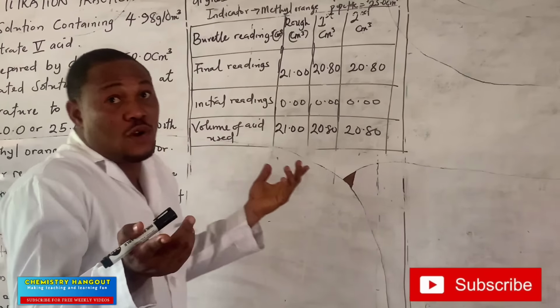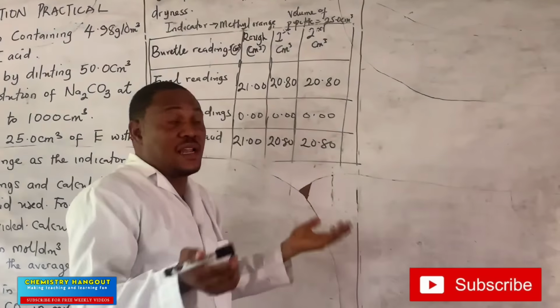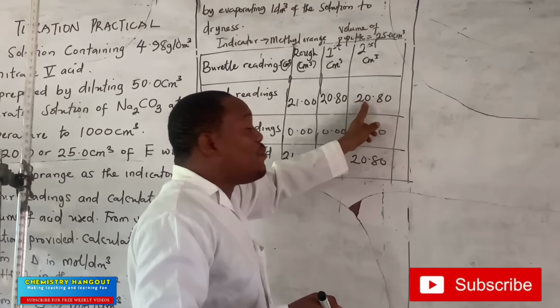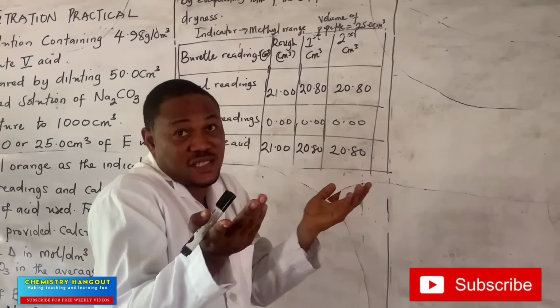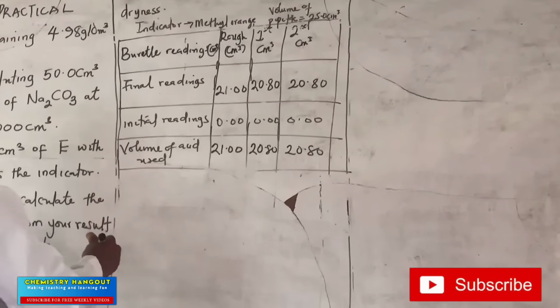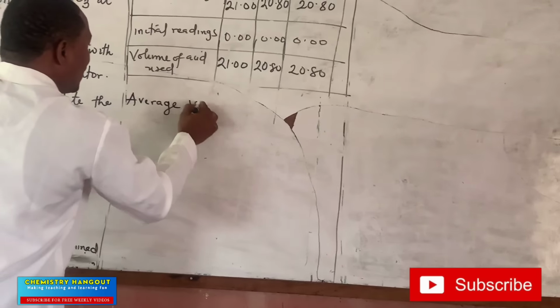And in your sentence, don't forget, some of you love to do first, second, and third. Fine. So you can have first to be 20.80, second to be 20.80. If you want to do third, it has to be closer to this. So probably maybe 20.90 or 20.70. Anyone is fine. I just had to use this. It's perfect.